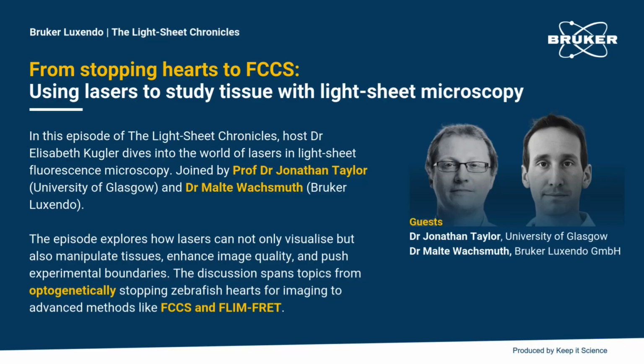But the great thing is, as you say, what we can then do and find out is really biochemistry in a living sample without actually being invasive. And so, for example, as you said, we can measure concentrations, but also binding or mobility or co-localization of, for example, proteins, which is really amazing.